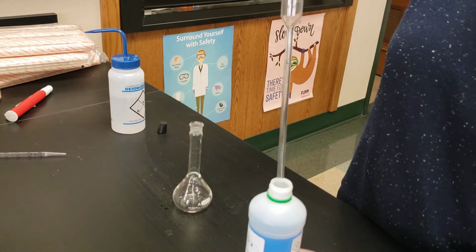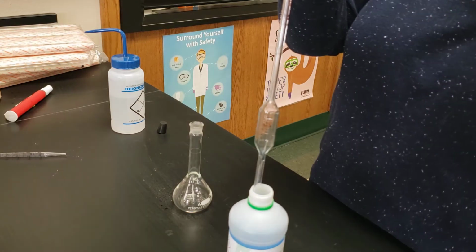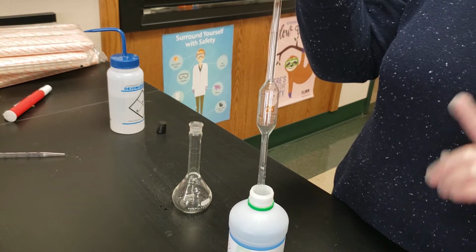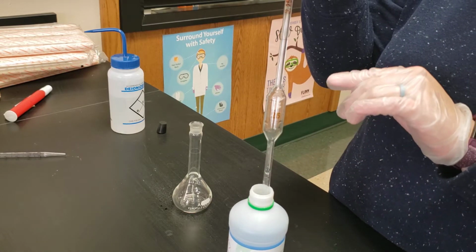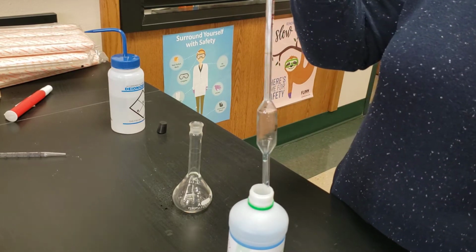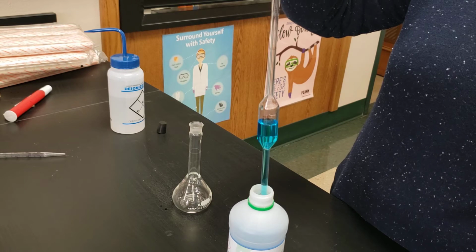Okay, so the first thing I'm going to do is measure out 40 milliliters of 0.5 molar copper 2 nitrate. To do that, I'm going to use two different pipettes so you guys get an example of both of them. The first is called a volumetric pipette. A volumetric pipette has one volume that it measures very accurately. I will use this pipette filler to draw liquid up, fill it up to the line, and then transfer it over into my volumetric flask. I'm making 100 milliliters of my solution, by the way.